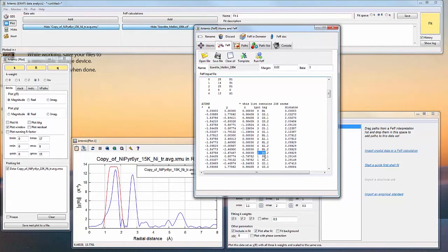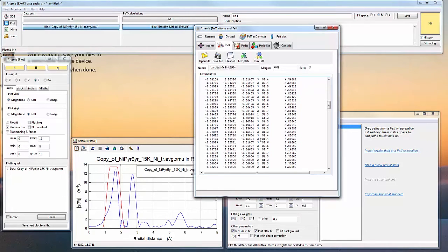I'm going to paste it in 3 times, and I'm doing it every other atom so that the degeneracy is similar between the two. Silicon I'm leaving the same. And the next place I see nickel where I could sub it out is about 5.3 angstroms, and then again at 6.1, which are out here. I'm not going to swap out any nickel for aluminum out here because I'm not going to fit out there, but you could if you wanted to.